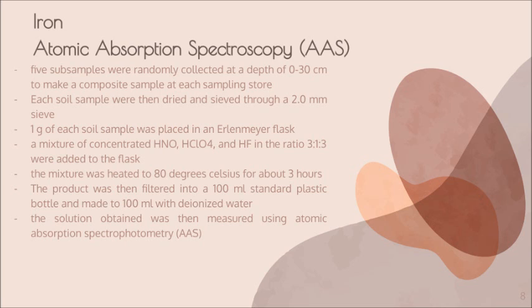Afterwards, the mixture was heated to 80 degrees Celsius for about 3 hours. The product was then filtered into a 100 ml standard plastic bottle and made up to 100 ml with deionized water. Lastly, the solution obtained was measured using atomic absorption spectroscopy.